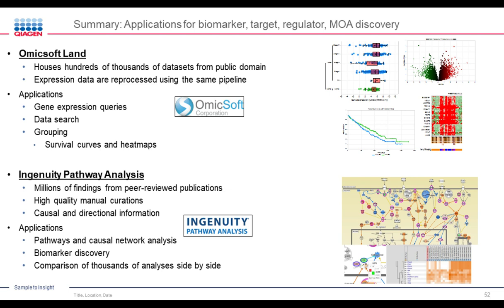And especially for things like Ingenuity Pathway Analysis, if you go to scholar.google.com, you see plenty of publications that cite IPA and use views that are generated by IPA. So all of the views are exportable. They're basically export button on top of the screen. You would just click on it, and then you would choose things like what type of image you want. Do you want JPEG or PNG? And in case of IPA, you can also adjust the resolution to really high resolution, like 300 dpi, 600 dpi, and so on. So everything is exportable, yes.